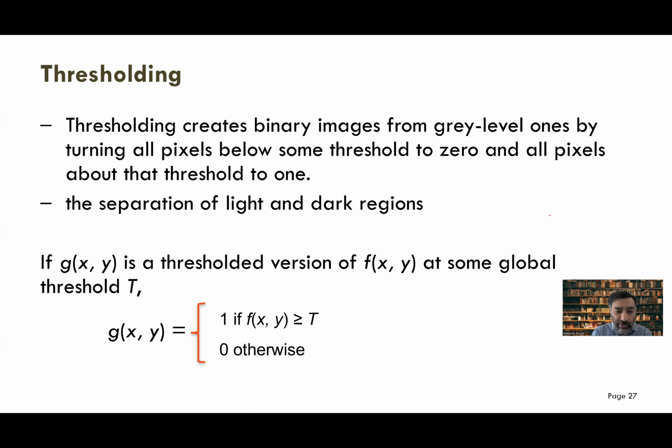So if your pixel value at a certain location is greater than t, for example, like we said, our images have pixel values between 0 and 255. Each pixel can have a value between 0 and 255. 255 means white, 0 means black, right? The maximum value depends on which channel it is, if this is a red channel, the intensity of that channel, or blue channel, or gray or the green channel.